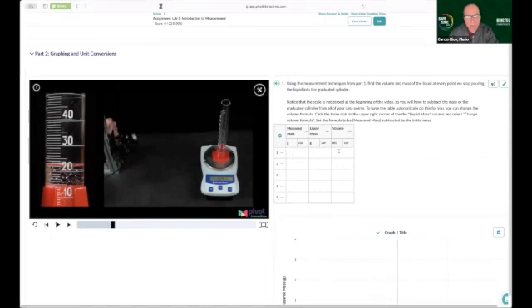That volume is going to be this last column. So I'm going to simply put 22 milliliters. I'm going to add one guess digit, which is going to be a 0.0. The units are given here on this column by milliliters, and that's the entry.